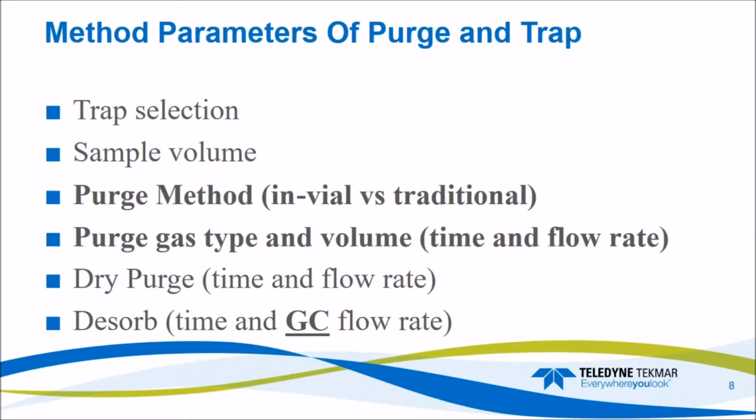For this webinar, we will be discussing the in-vial versus traditional purge methods or techniques and purge gas type and volume.